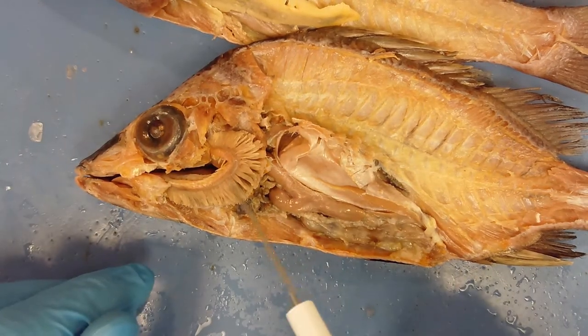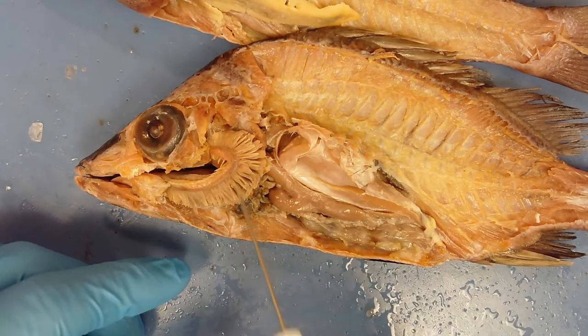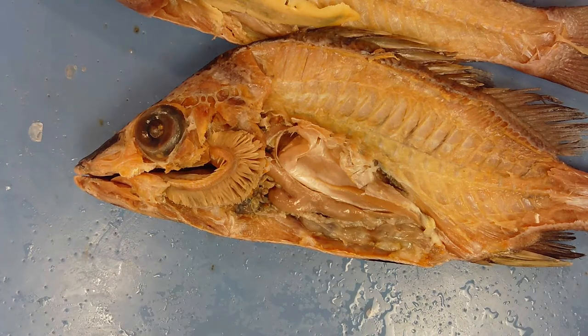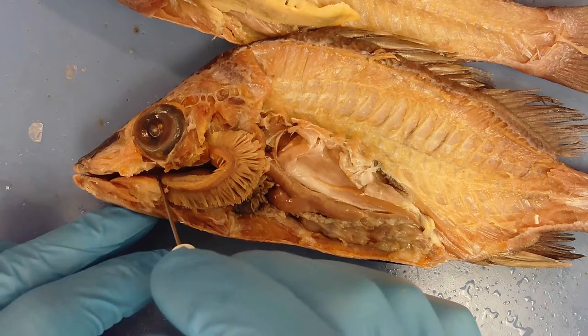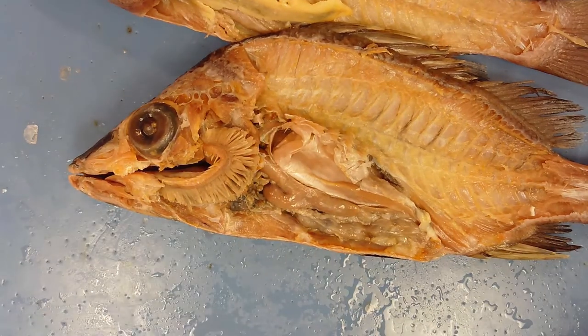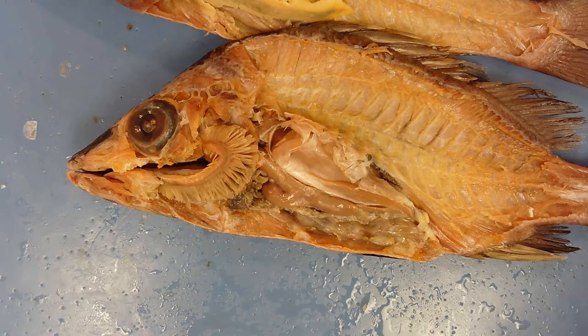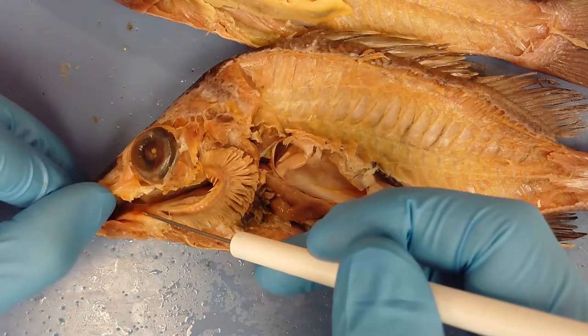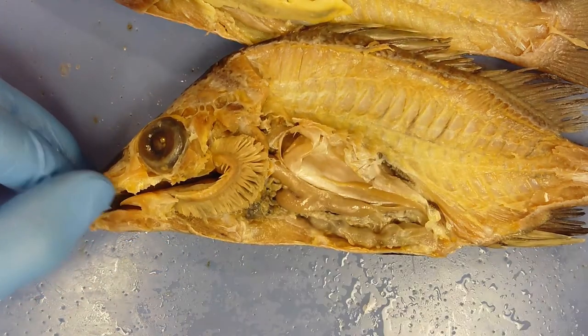Fish like sharks don't pump water this way — they use ram breathing. They simply keep their mouth open as they swim forward, and water passes over their gills that way.